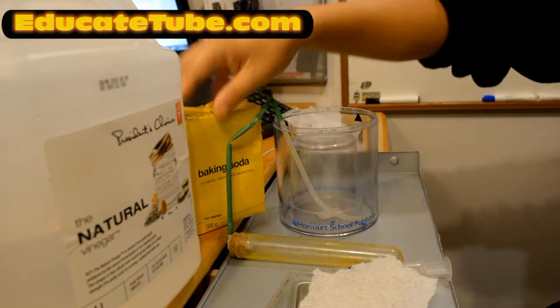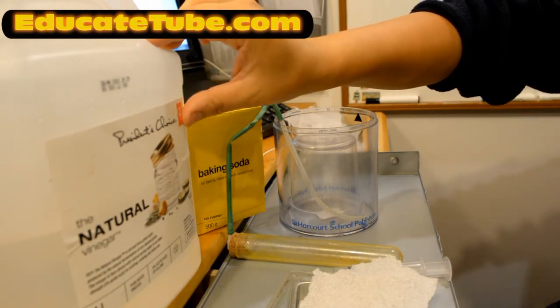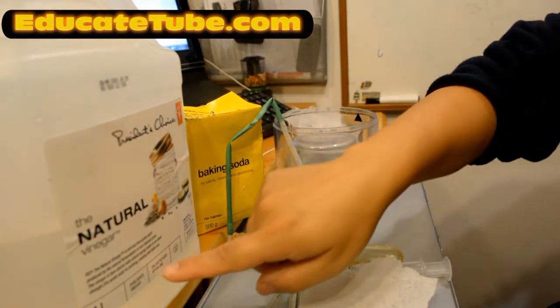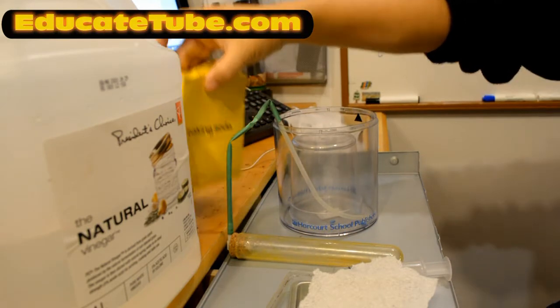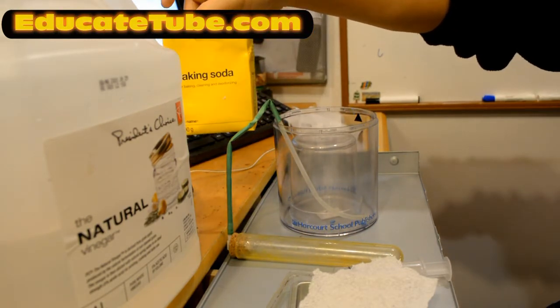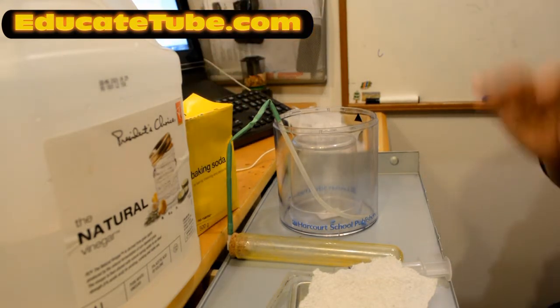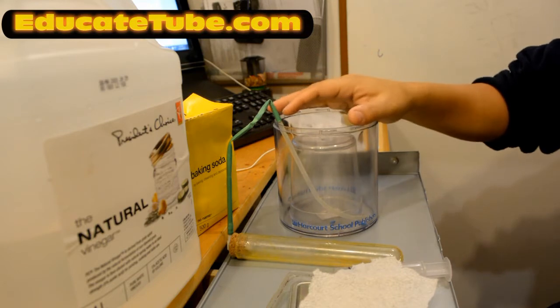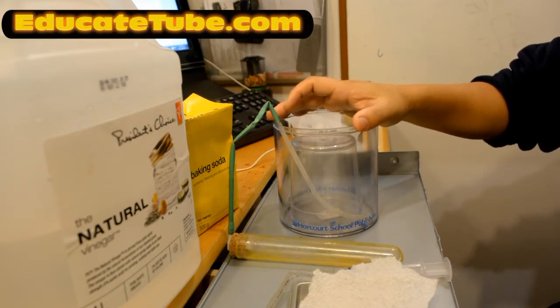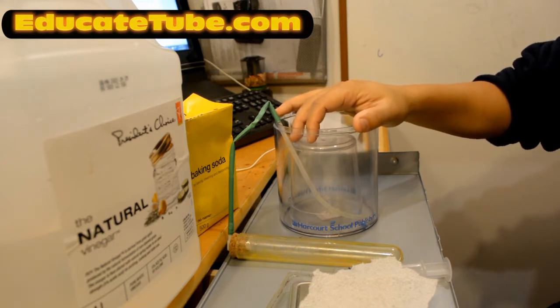We assume, of course, this is pure sodium bicarbonate, and we're assuming this is 5% acetic acid, vinegar. All these assumptions we're going to make, and it does say here 5% acetic acid, but we don't know that for sure. That's based on the manufacturer's labeling. And I'm pretty sure the baking soda, sodium bicarbonate, is quite pure. Most of them have about 99% purity, so I'm hoping it's about that. Based on these two, there'll be some error, maybe no more than 5 to 10%. So we should still get close to 250 to 290 milliliters maximum of carbon dioxide gas. Okay, let's get started.